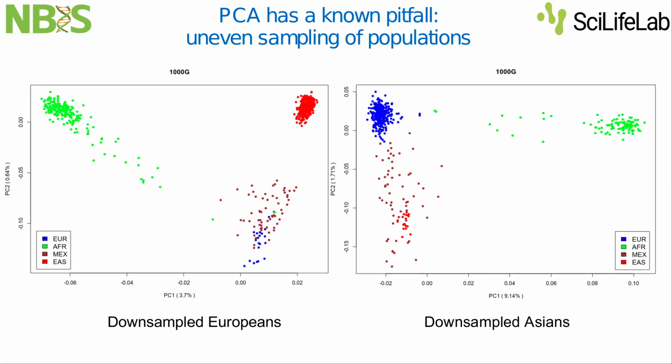So PCA is unsupervised learning. It doesn't know anything about populations, so it doesn't know which cluster is big and which cluster is small. It assumes that all of them are more or less of equal size. And that's why when you compute the variance covariance matrix, this equal representation of all clusters is already coded in the equation. That's why this effect becomes visible. So please just keep it in mind.